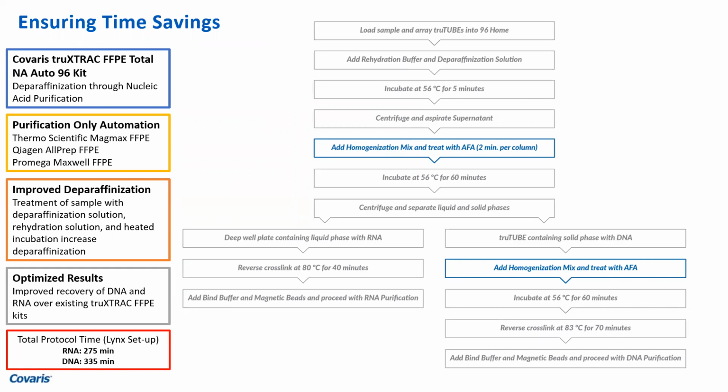So you take your samples in a 96 rack and you add some buffer and you wait for 5 minutes and then you switch on the AFA. Gone. First step, what's gone? The paraffin moved. So it emulsifies your exposed tissue. And then you incubate it and you subject it to AFA again. Now you have disrupted the tissue. Out comes the DNA and RNA.